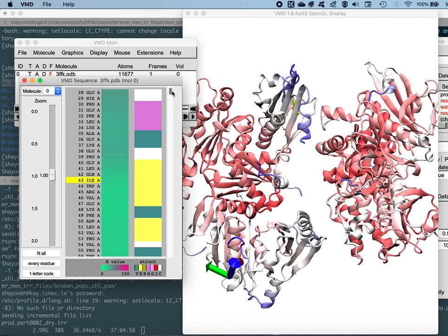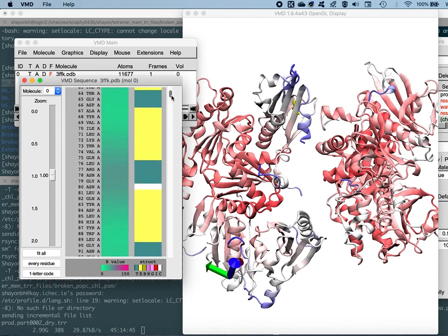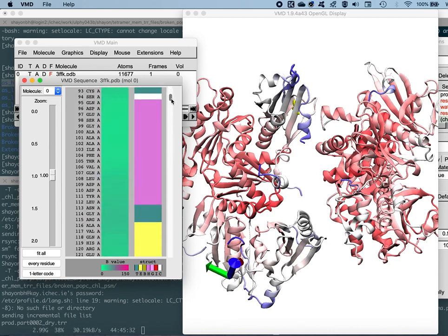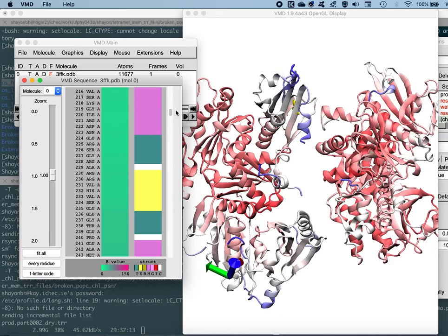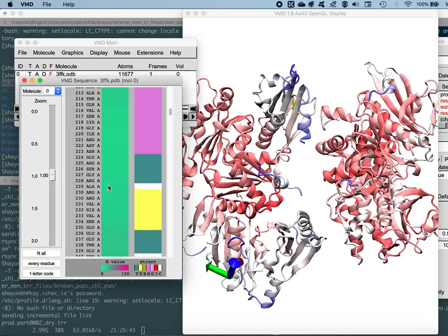And now we look for any other region which is very, very light in shade, light shade of green, let's say. So select the proper region. So let's say this region out here. I'm guessing this lighter shade of green will be highly structured, and this will probably be buried inside somewhere around here, and therefore they would be less fluctuating and the dynamicity would be restricted in that manner. So let's go ahead and select that.